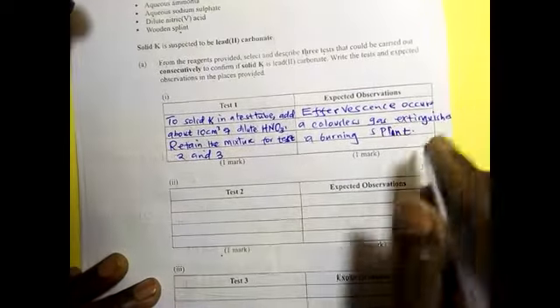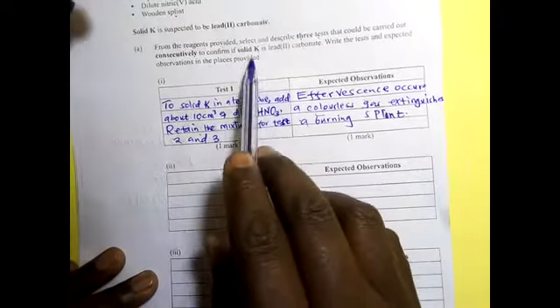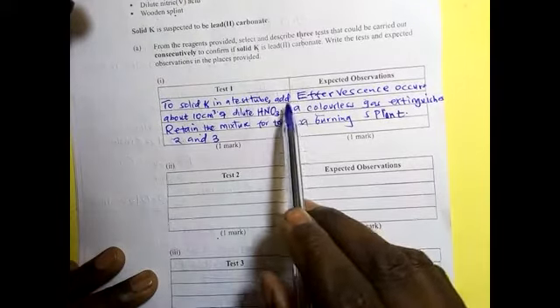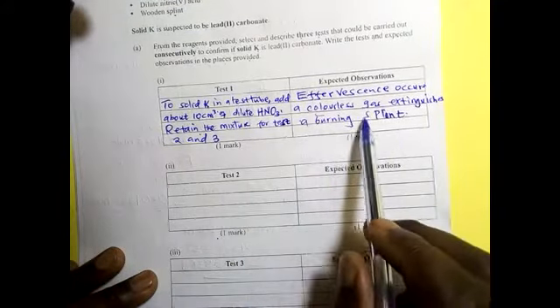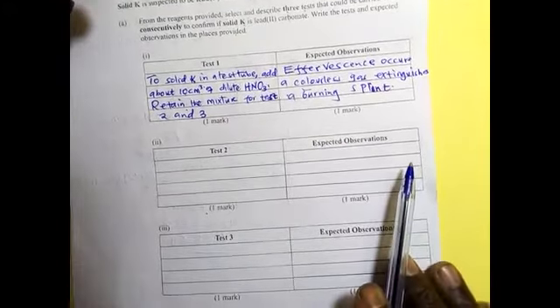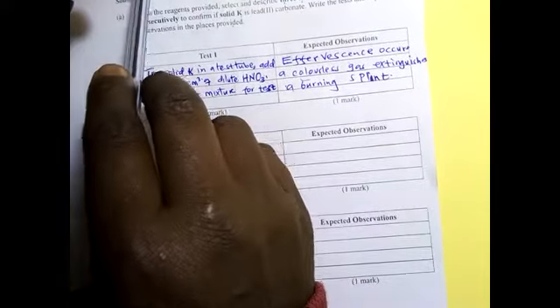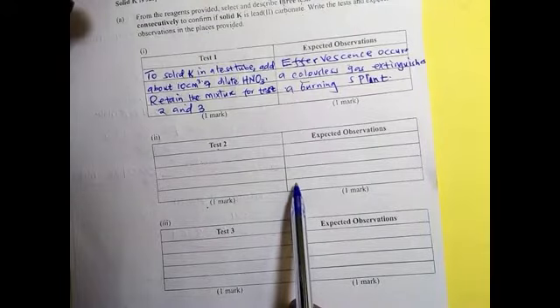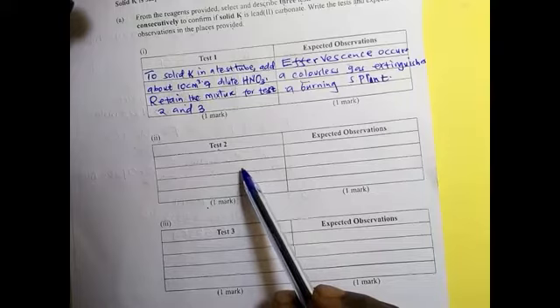Let us go to test number 2. With that one, these are the things we need to confirm: this one will produce effervescence, and the effervescence is produced because of the carbon dioxide gas that will extinguish a burning splint when it is introduced to it. Test number 2: now we have the reagents aqueous ammonia and sodium sulfate. You cannot use the aqueous sodium sulfate before you use ammonia. So ammonia will come before the sodium sulfate.